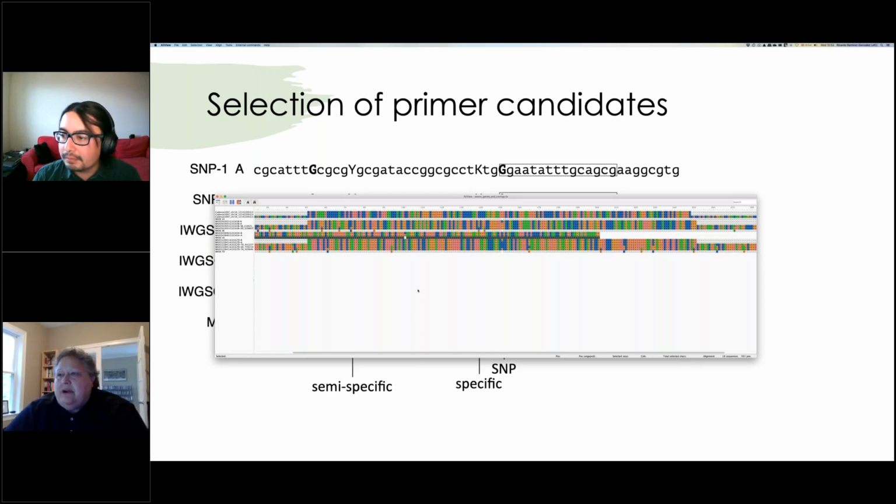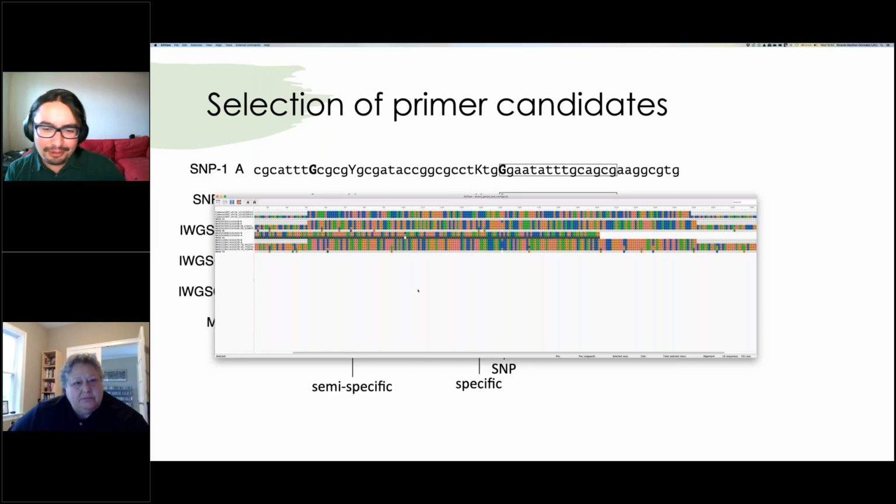Can you use the primer for homeolog specific expression analysis? I think you kind of addressed that a little already. Yes. Elaborate on that a little bit. Yes. I expect that it should work. The version for amplicons should work. But I haven't tested personally. So if you try it and it works, I will be happy to get any feedback or tricks to improve it.